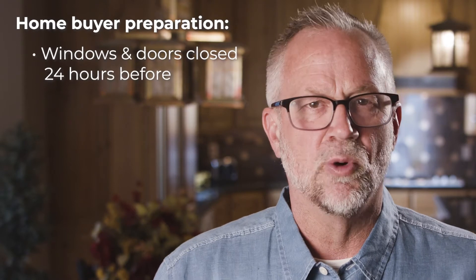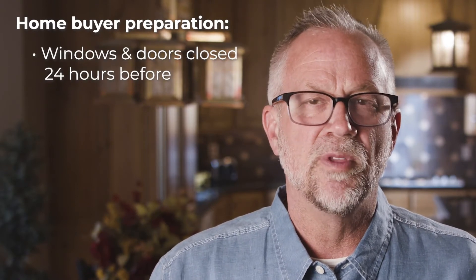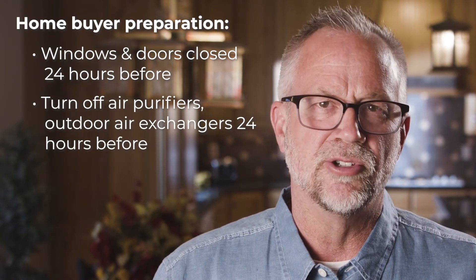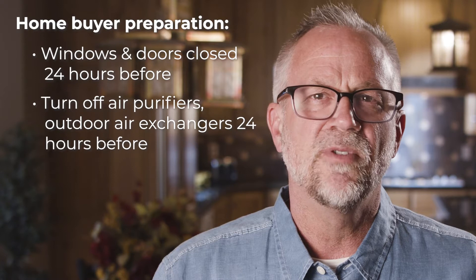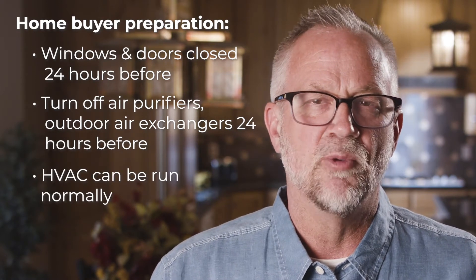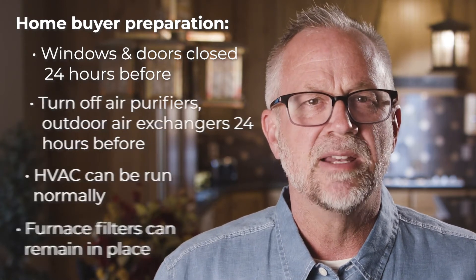If you schedule an appointment for collecting air samples in advance, you'll want to make sure the residents of the property are informed about a few best practices for the collection. Have them keep windows and doors closed as much as possible for 24 hours before the appointment. Any air purifiers and outdoor air exchangers should be turned off 24 hours before the appointment as well. But their HVAC system can run normally and any attached furnace filters should remain in place.